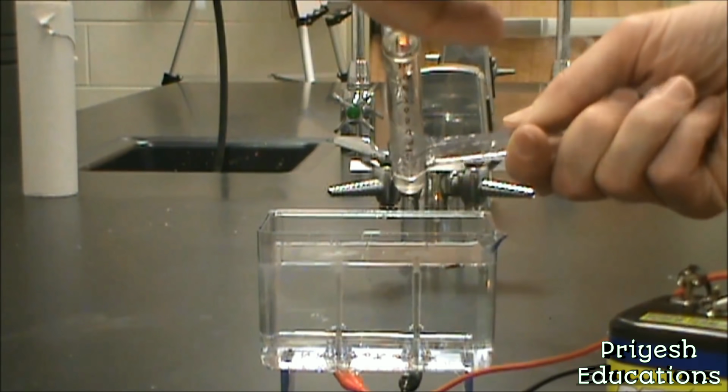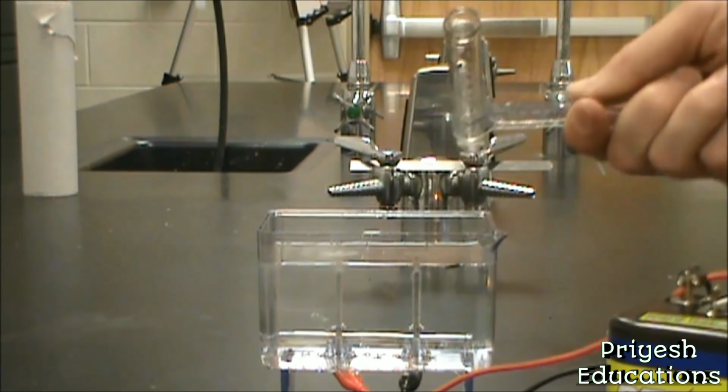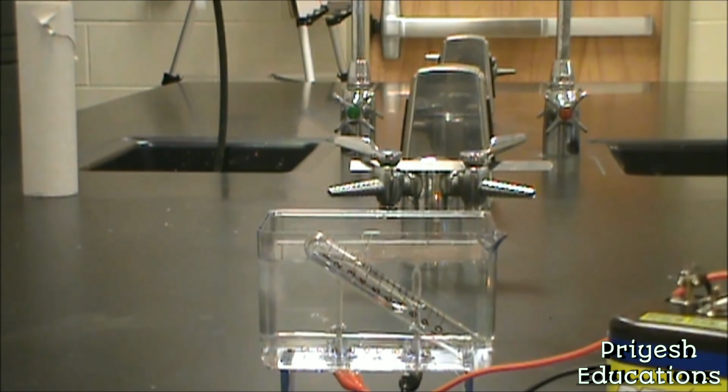So we have our splint out, and we have our splint back on fire. So again, we're seeing a 2-to-1 ratio of hydrogen gas to oxygen gas, and confirmation of what the two gases are.